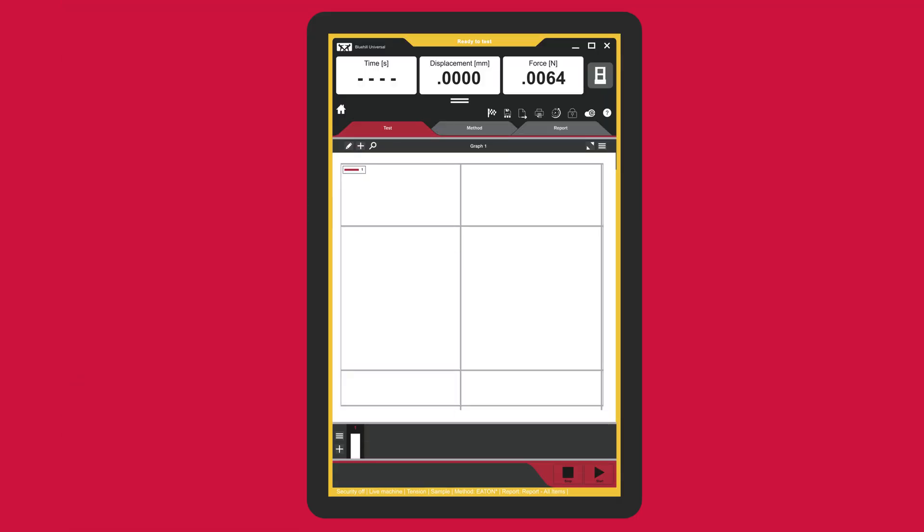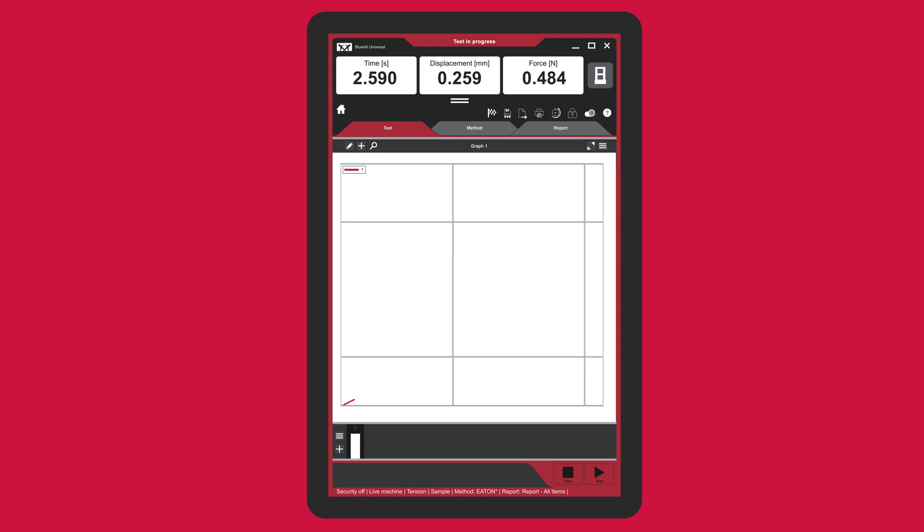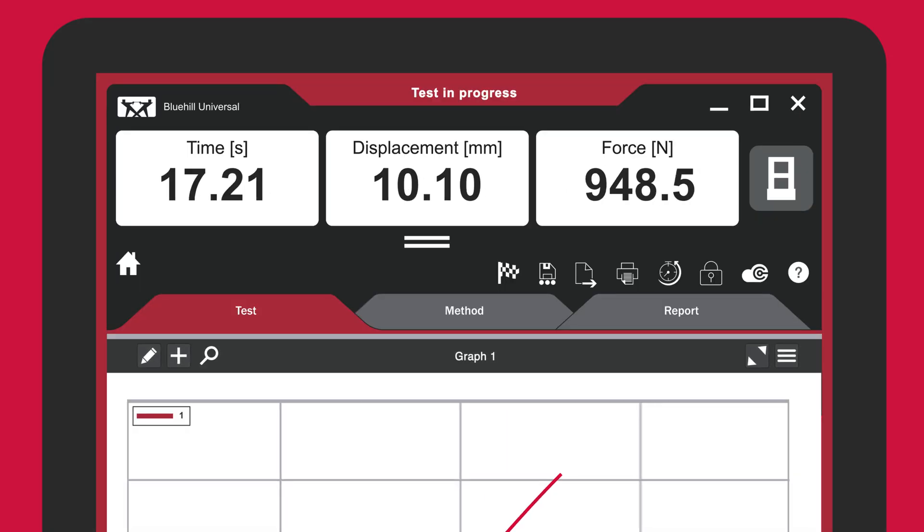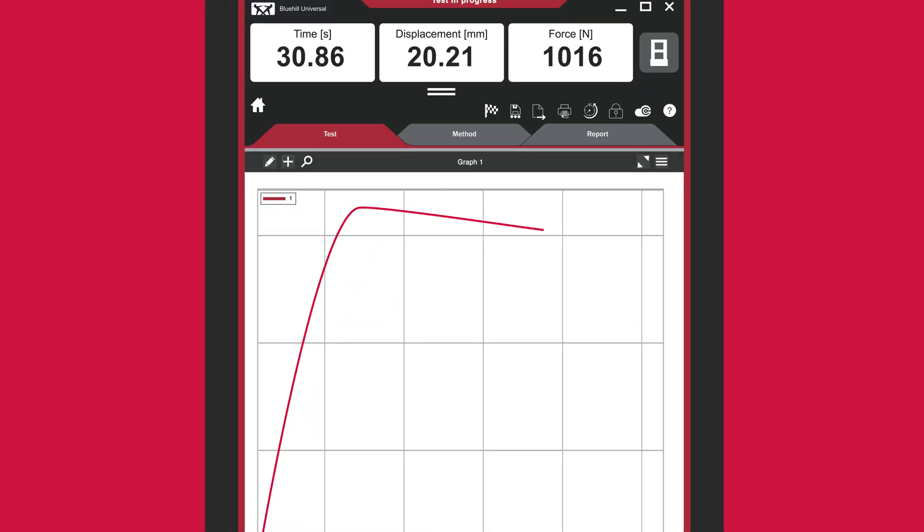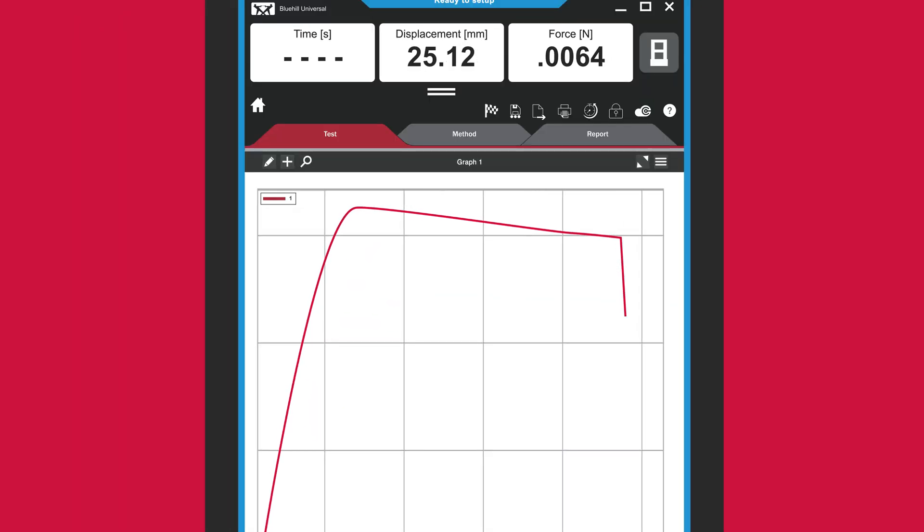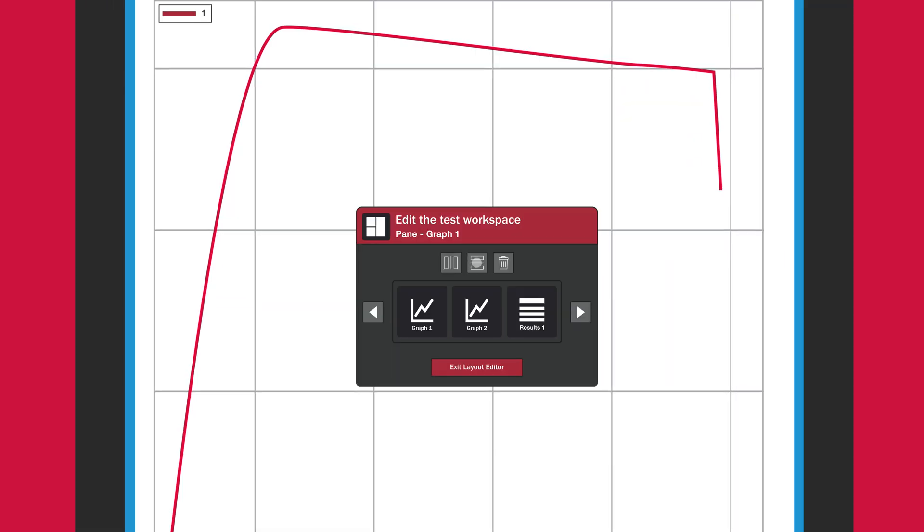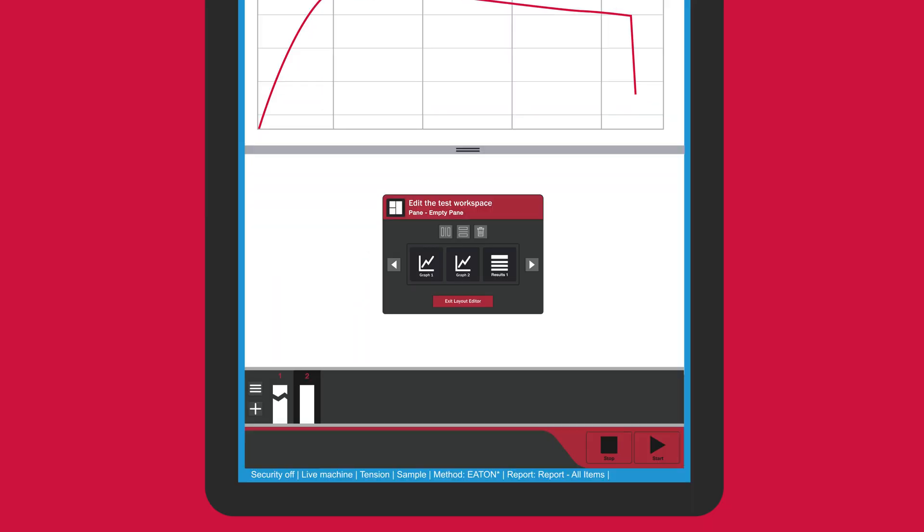Live data channels are visible in both the live display panel and the graph within the test workspace. Getting a closer look at your data is easy with the customizable layout editor and graphing tools.